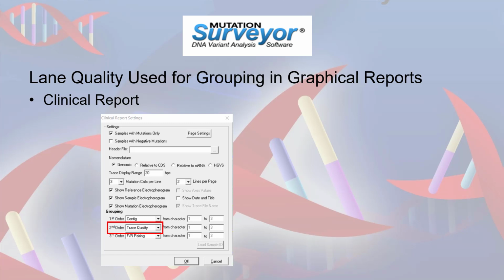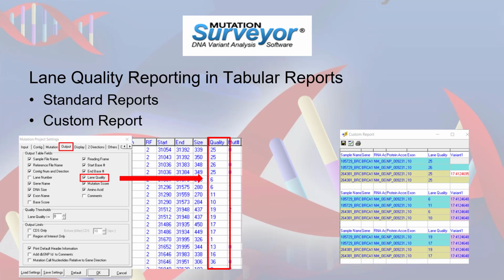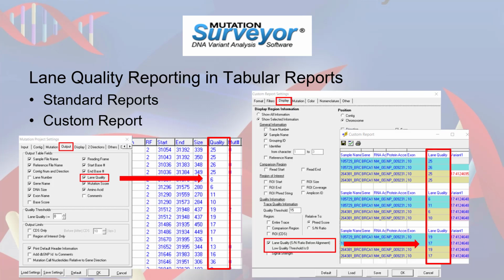Trace quality is available for second and third order grouping, and when selected, will result in traces sorted within the first order grouping based on the lane quality for the trace. For tabular reports, lane quality will be output in the standard reports when lane quality is selected for display from the output table fields located on the Output tab of the Mutation Project settings, and also in the Custom report when lane quality is selected from the Display tab of the Custom Report Settings dialog.